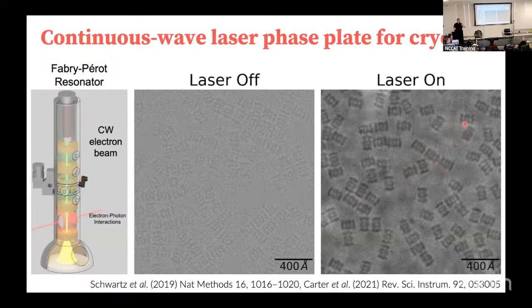This is being used in a single particle case to show the enhancement, but this could also be very easily applied to cryotomography. Also emerging more in data collection schemes is the 2D template matching that Bronwyn Lucas and Nico Grigoriev have developed, where you don't tilt the stage, but you want to get as high contrast and high resolution images of a given complex.